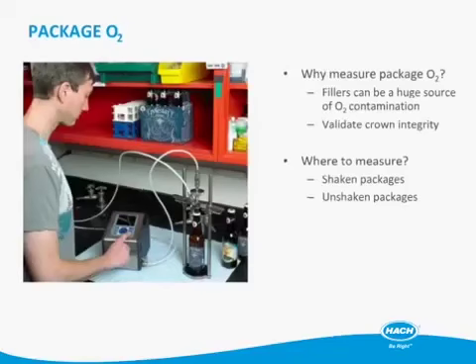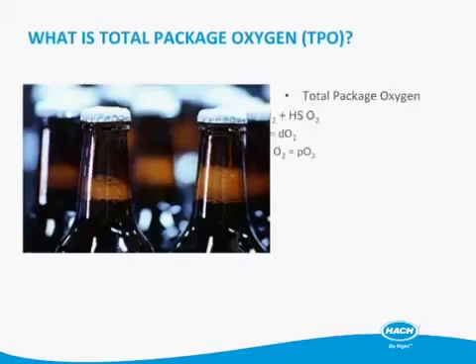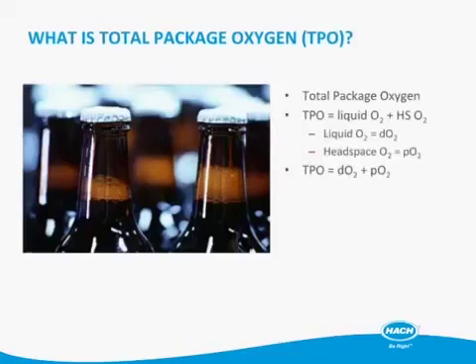So what is total package oxygen? Total package oxygen is all of the O2 that's in the liquid and in the headspace. So it's the O2 trapped in the liquid that came from the bright beer tank and was picked up in the filler, and then the headspace O2 is the O2 that was in the foam after fobbing, after the closure goes on.